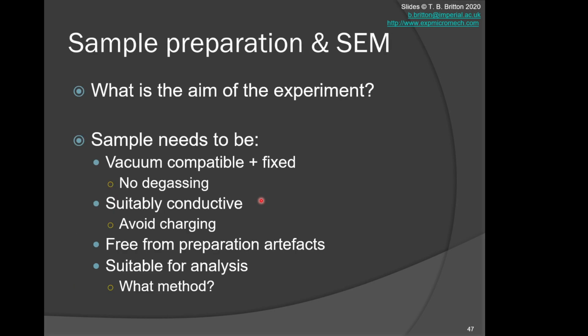A major aspect of scanning electron microscopy is actually about sample preparation, because if you spend time preparing good samples, you'll get more data.